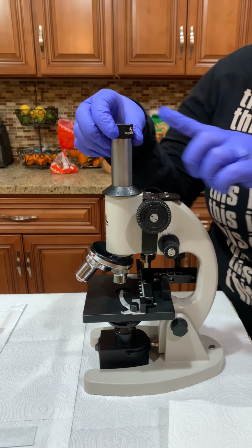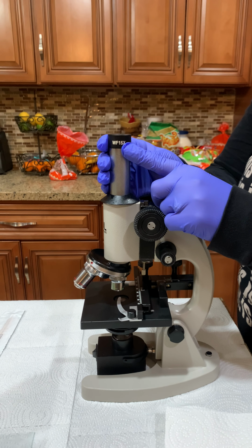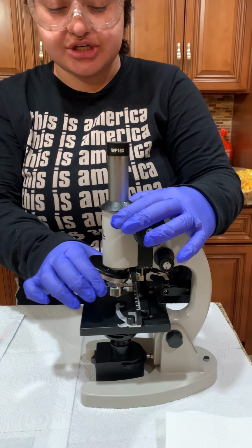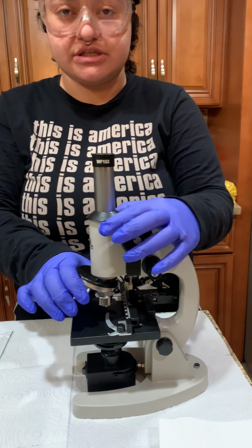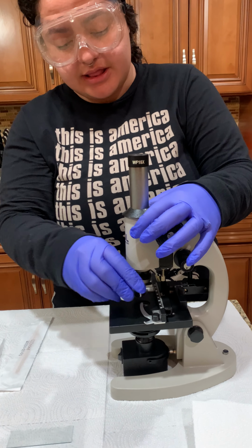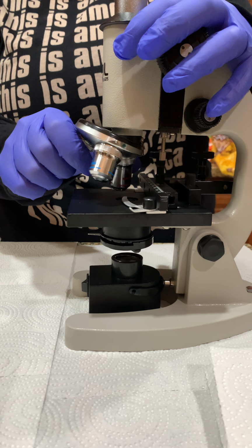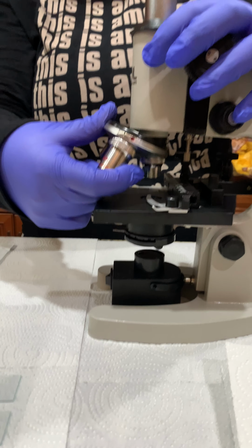So right here is the ocular lens. It's the eyepiece where we see from, and you can see right here it has a power of 15x. This is the eyepiece tube, which will go down into the turret, which turns to have the objective lenses. So the turret holds on to the different objective lenses and we can turn them. There's 3 objective lenses. This is the smallest, which is a 4x. It's the lowest power of magnification. The second one is a 10x, and then the last one is a 40x.